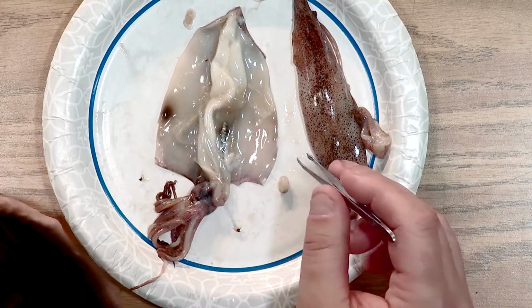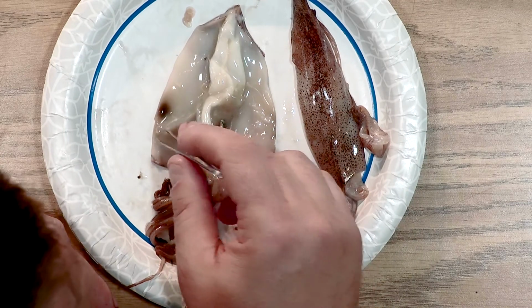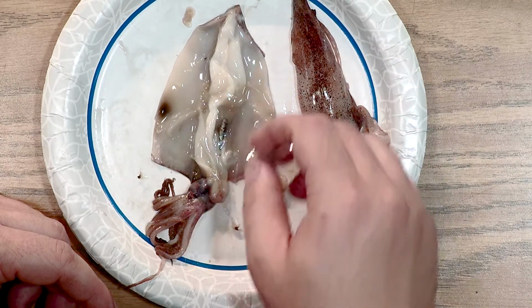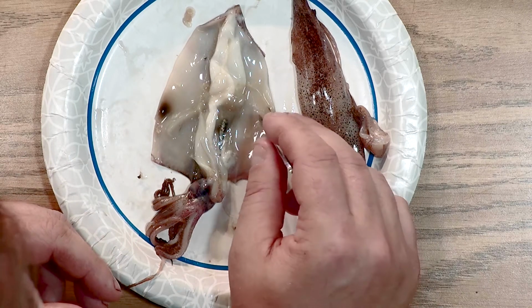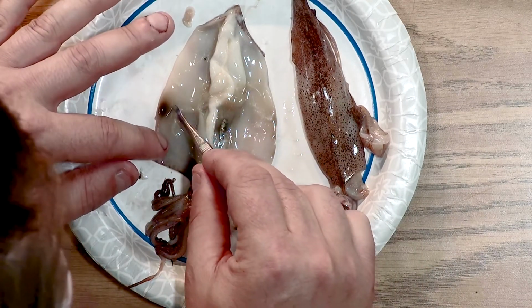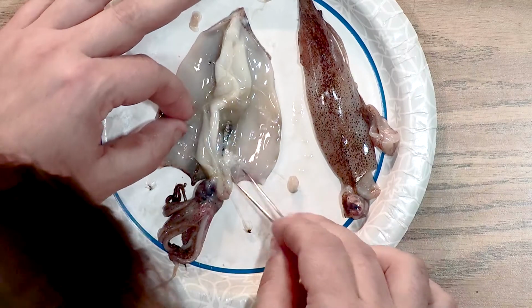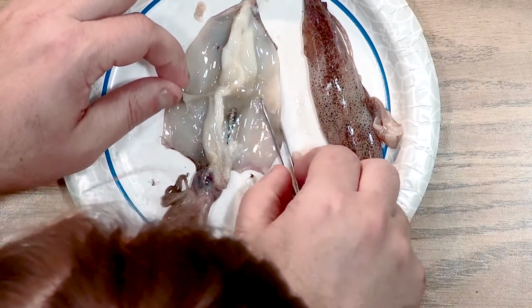one organ that we are not going to be able to see is the heart. Now, squid, little trivia for you, actually have 3 hearts. They have one systemic heart that operates their entire body, and then each gill has its own heart. Now, the gills, or like the lungs, are over here on the side, and they attach to the mantle, but with a little help, I can kind of separate them.